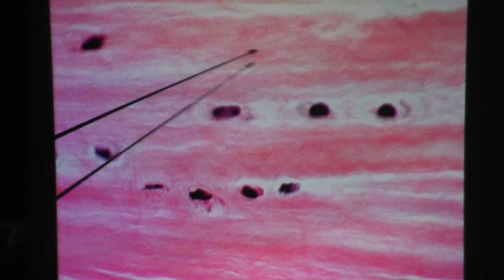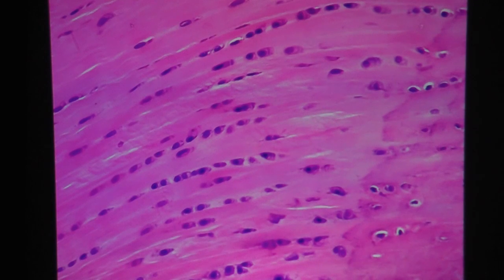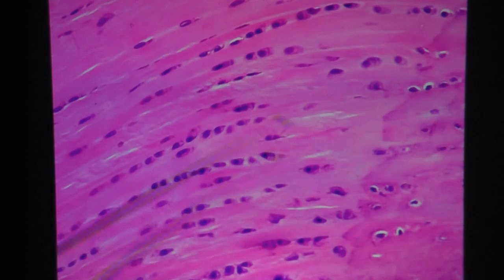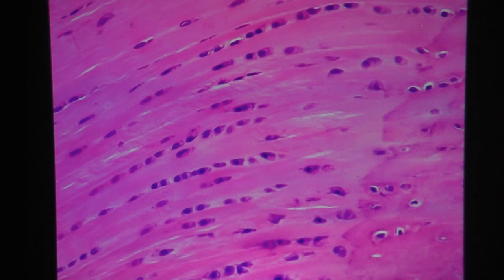Here's another look under high power. You can see the chondrocytes in lacuna, and in between there's a little bit of pink waviness — that would be collagen fibers, making this fibrocartilage. Another view of fibrocartilage: same thing, chondrocytes in lacunas, many of them here. The pink background waviness would be the collagen fibers of fibrocartilage.